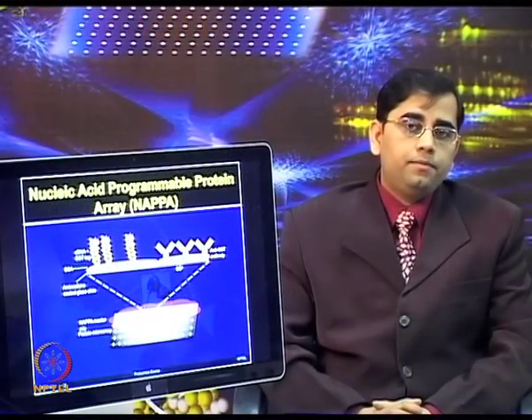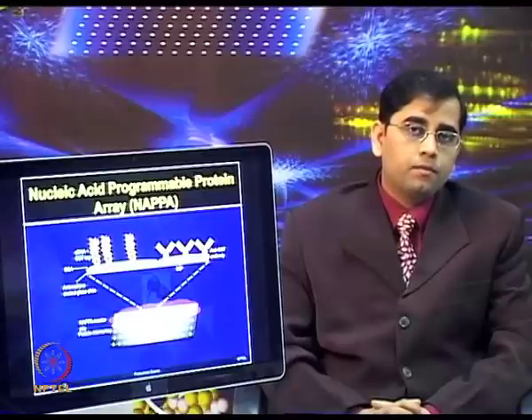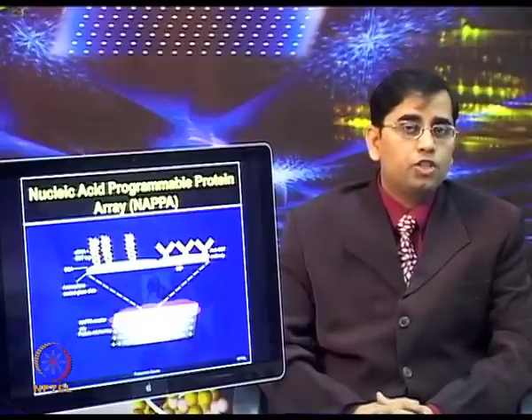So, in the NAPPA method, a glass slide is first coated with aminosilane reagent. Once this functionalization is done, then a master mix is printed on the chip surface.